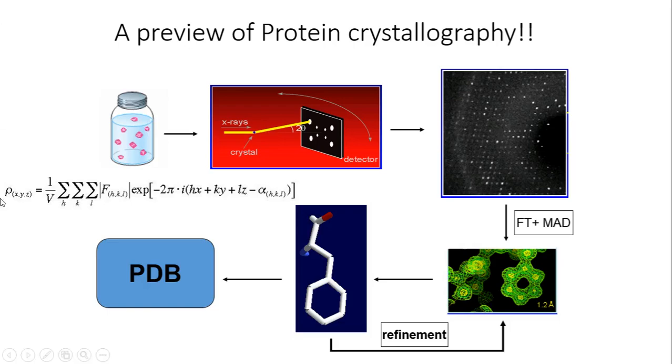So the very first step you can consider is that you need to figure out the crystallization condition. In order to figure out the crystallization condition, there are a few steps that happen before this step as well.